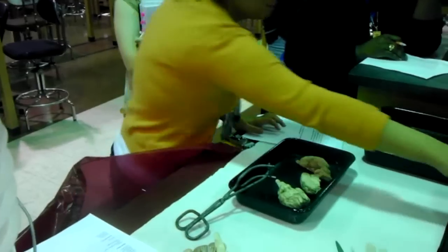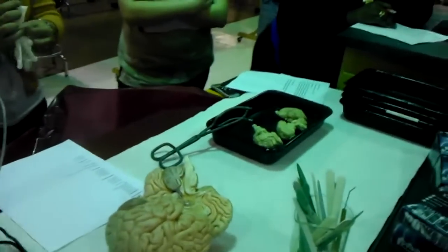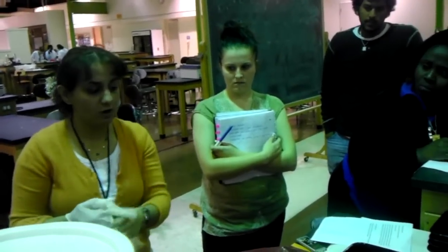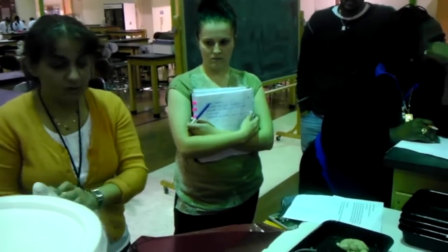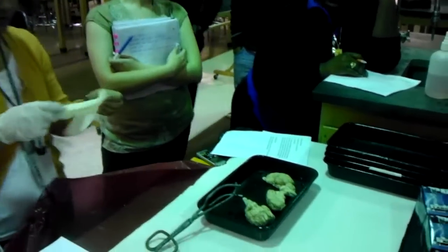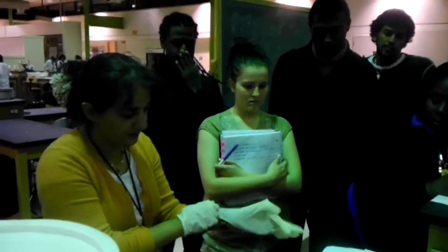Okay, let's do it. In your lab manual, guys, you have the full instruction to help you know how to dissect the sheep brain. Make sure that you follow the instruction and then do the dissection, and make sure that you can find all of these structures on the whole brain and on the dissected one.